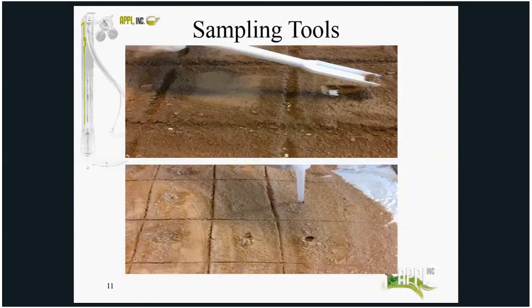The sampling tools are important also. A square scoop is designed to get to the bottom of the sample so that all particle sizes are included in the increments taken. It's important to collect a representative sample, which includes all of the fines that are on the bottom of the foil. This is especially true for samples that are not ground because they have more particle size variation.